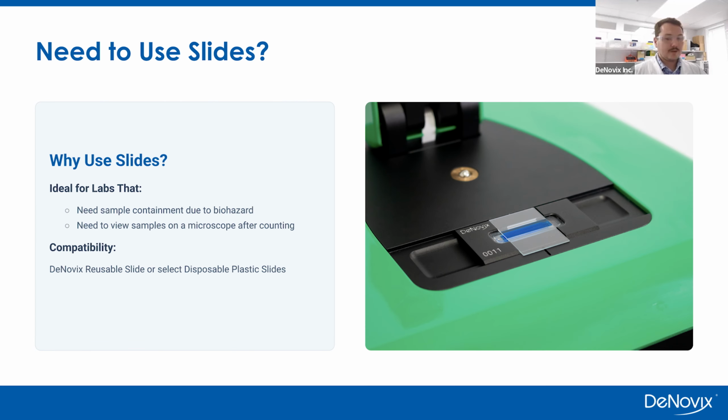If you're sitting there right now and you may work with samples that are biohazardous and you need to use slides in your workflow, you can still use slides on the CellDrop. We do have a slide mode. You can use our DeNovix reusable slide or select disposable slides.